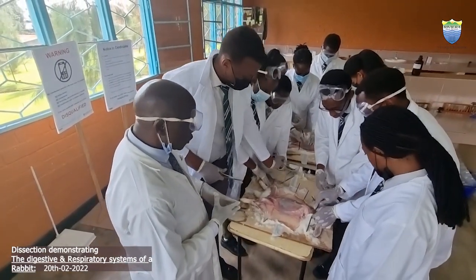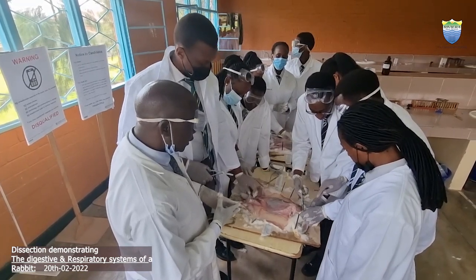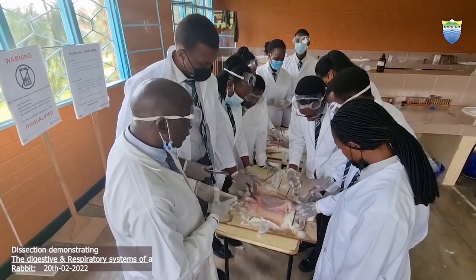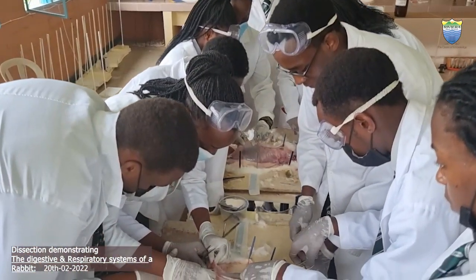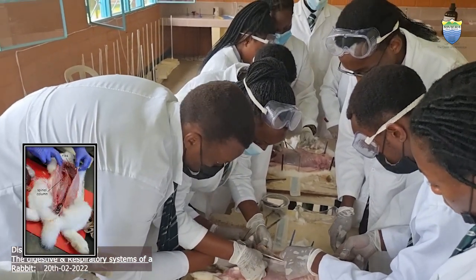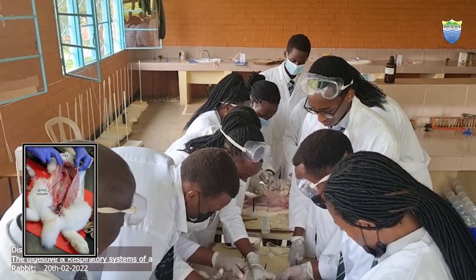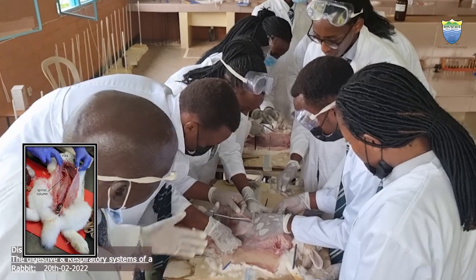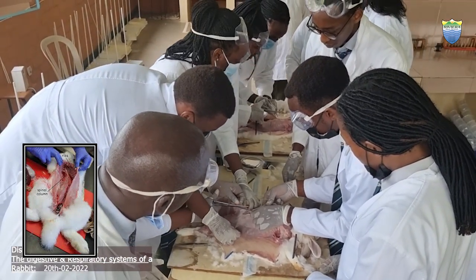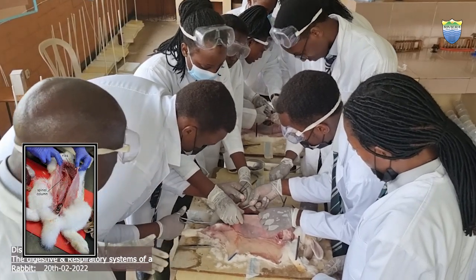So we are going to use our display here to demonstrate the respiratory system and the digestive system. Right now we are opening the abdominal cavity. How far have we gone, guys, on the other side? You have already opened? No, you are still open.